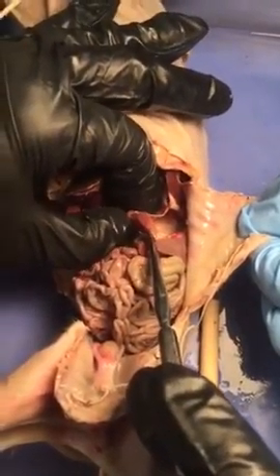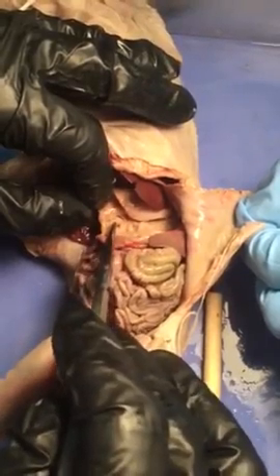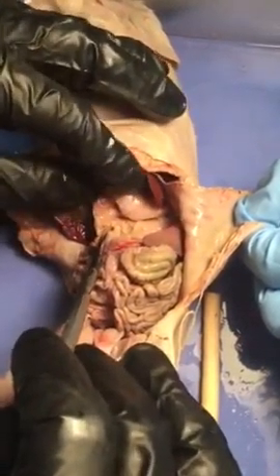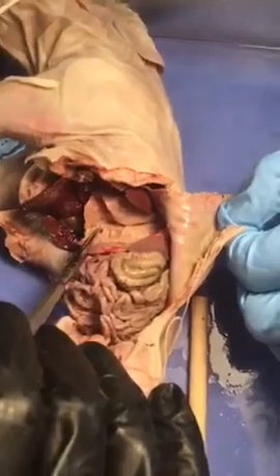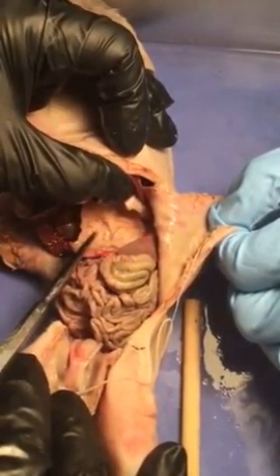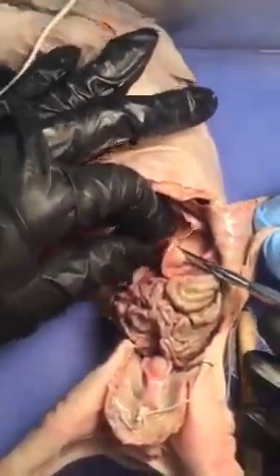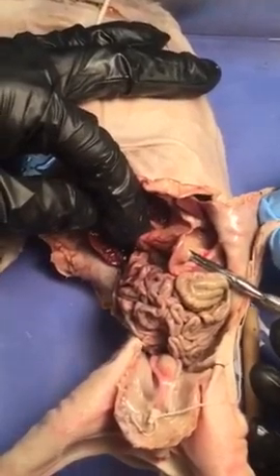Yes. Okay, if you grab this on the other side, it's very hard. Very muscular. All right, so what is this? That is the pyloric sphincter. Okay, so this is the bottom end of the stomach. This region that leads to this is called the pyloric region of the stomach, or the pylorus. From here, food is going to be squirted a little bit at a time into the duodenum, which is right here, the very beginning.